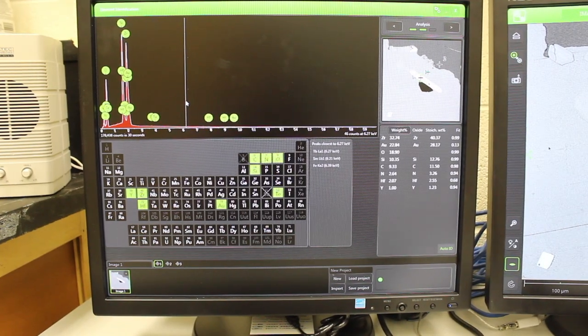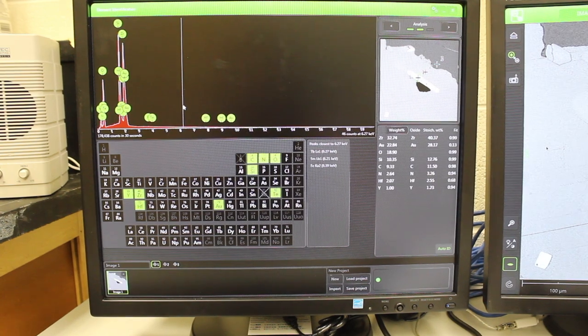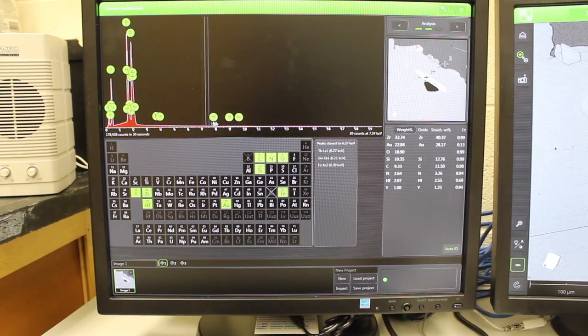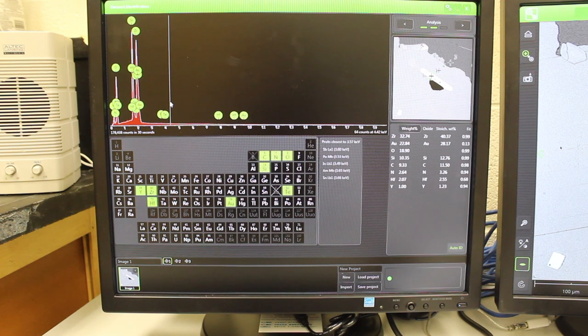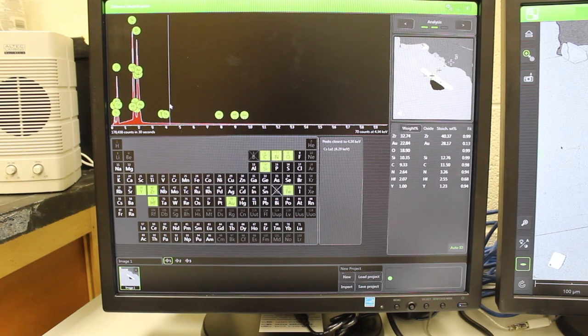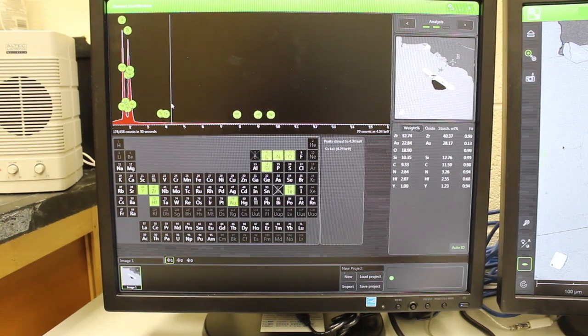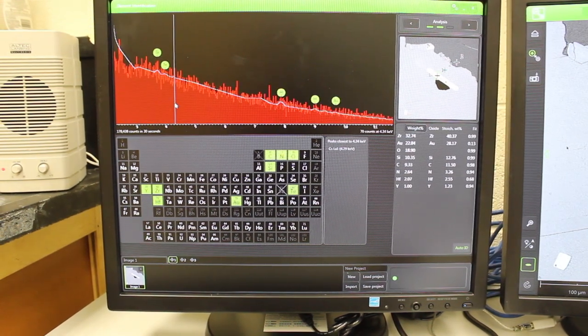In this first analysis I can see the EDS spectrum at the top here in red. I can change it by using the mouse so I can use the center scroll button to zoom in and out.